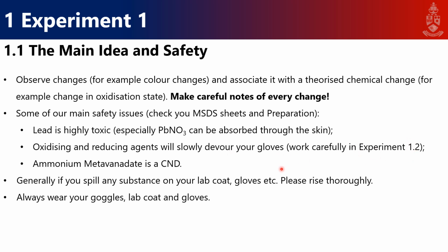especially in experiment 1.2. You'll also be working with something called ammonium metavanadate, which is a central nervous system depressant. Essentially, it can paralyze you. It can hamper your breathing, and overall a very bad experience. Now, its toxic level is about 5 grams, so it's highly unlikely that you'd ingest that much in a single dose, but it's not something that you should be ingesting at all. It can be quite volatile, so please be careful with it.